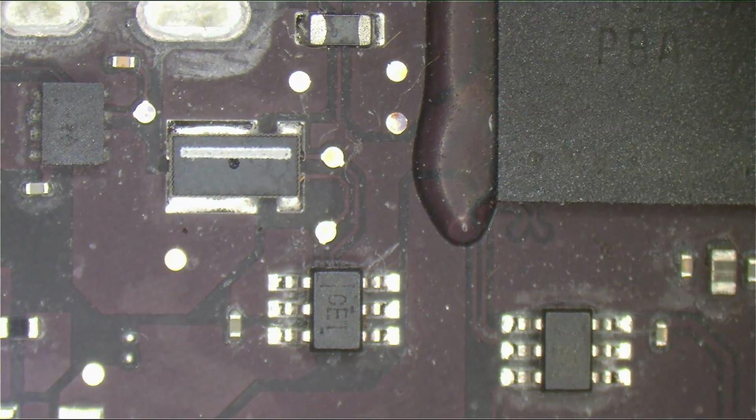The next feature that's important to me is adjustable zoom. Now, admittedly, I do most of my work at 7x or 10x, and I'm going to go over why that is with a quick example here. The reason I do most of my work at a low zoom is because when you use a high zoom, it's very easy to go out of focus.